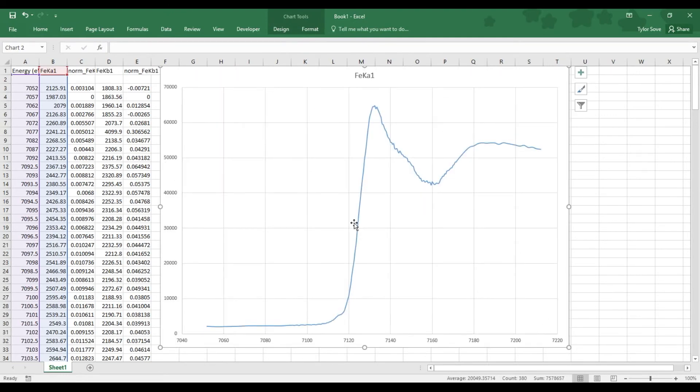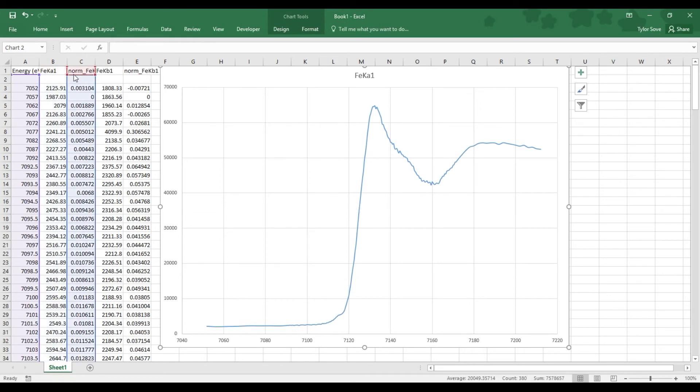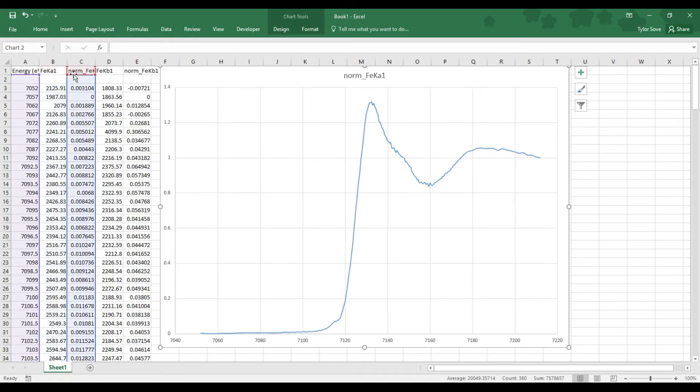To see the difference between the normalized and unnormalized data, I'll simply shift this data over to the normalized or from the unnormalized to the normalized, and you can see the shape hasn't changed.